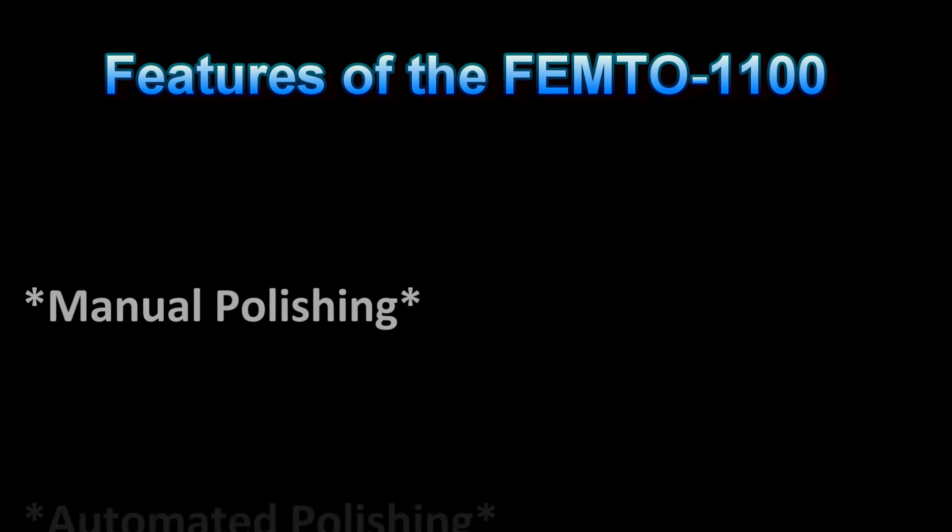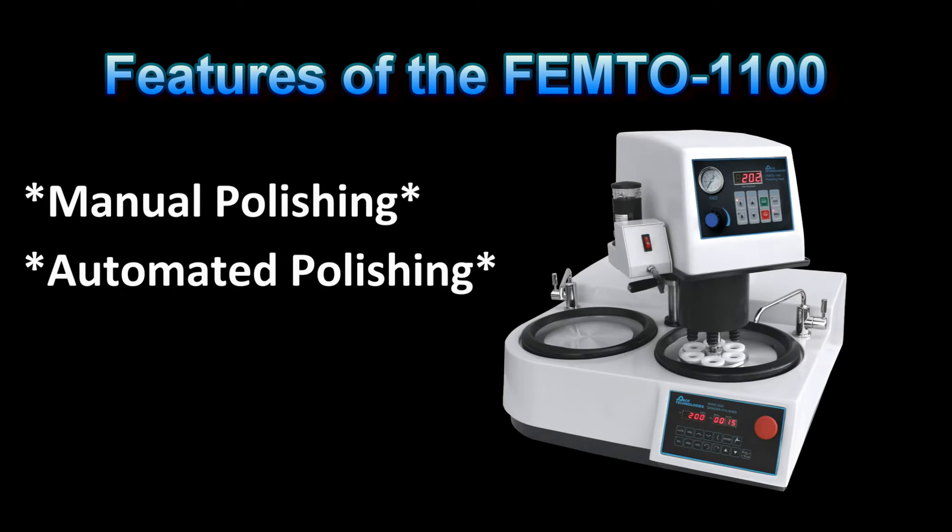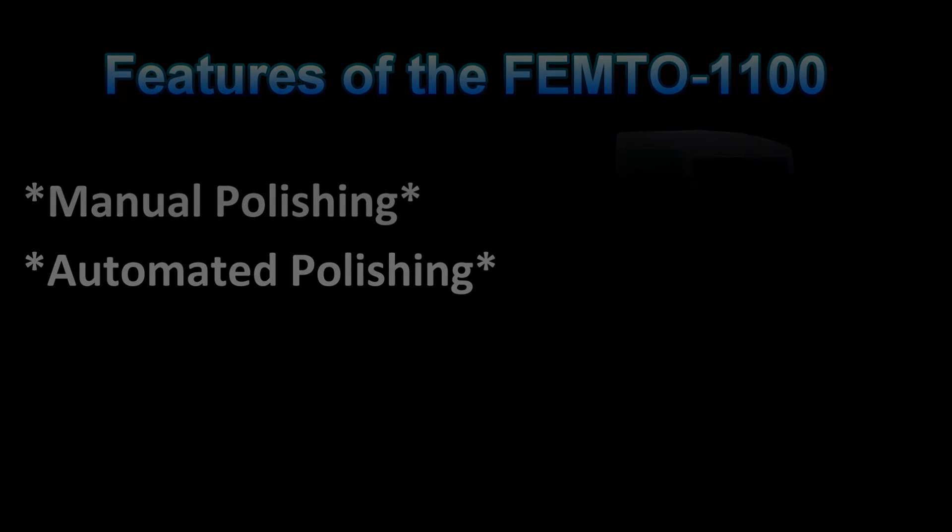The Femto 1100 polishing head can be operated independently from the Nano polisher base by running it in the manual mode. The reason to operate the Femto in manual mode is to simulate manual hand grinding, where the direction of polishing can be controlled. This is very useful for preparing specimens with coatings.